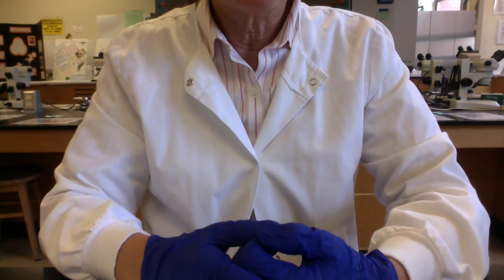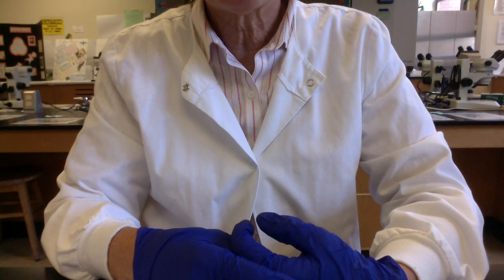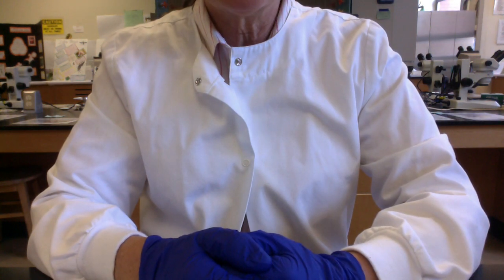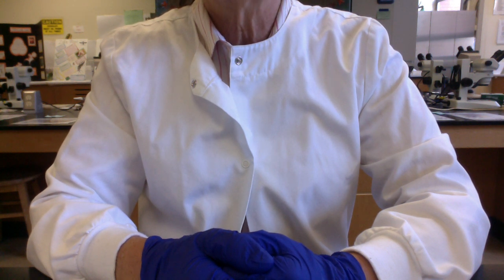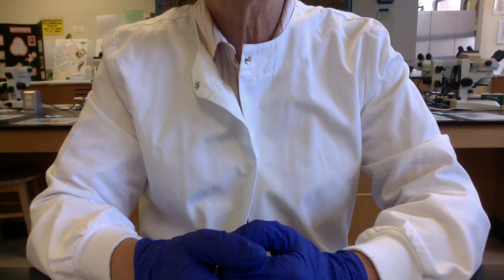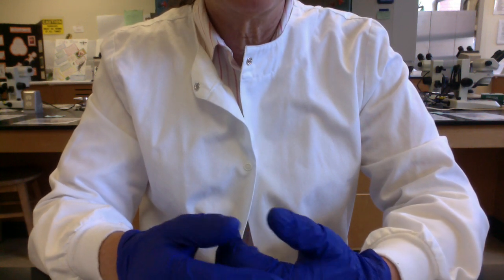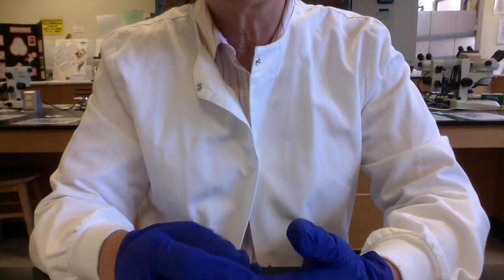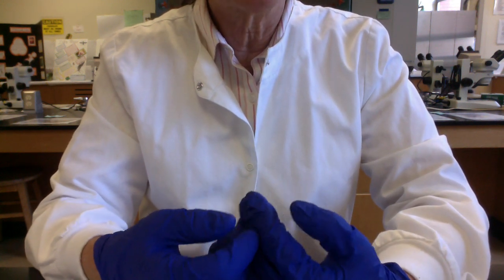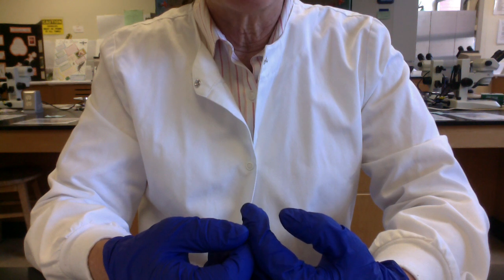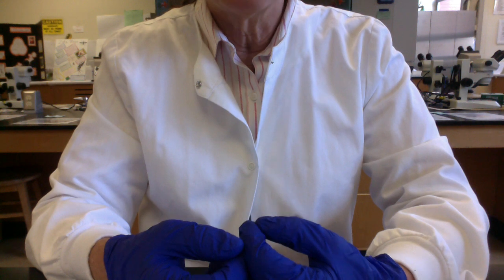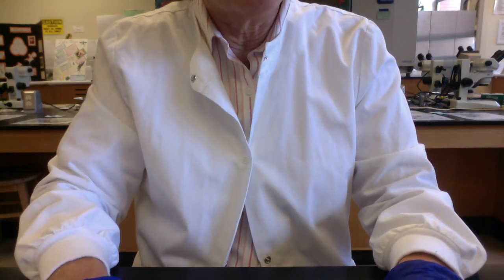So I'm going to go ahead and stand less here, so we'll have more screen for our visuals. What we're first going to do is start with chapter 10 in our lab manual. Chapter 10 is on microbial growth media. Media is the term we use to describe food for our microbes. In the labs, to be able to study our microbes, to be able to identify them, to be able to do antibiotic sensitivity testing, we have to be able to grow our microbes.